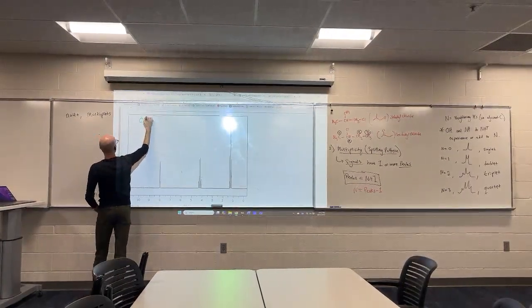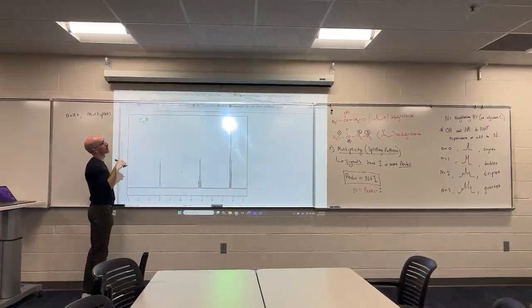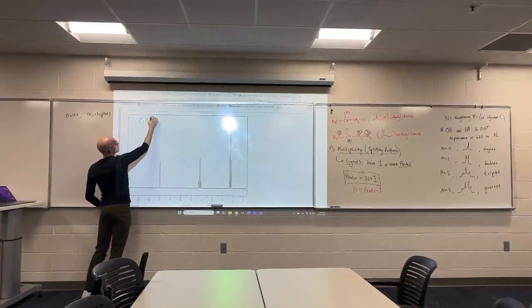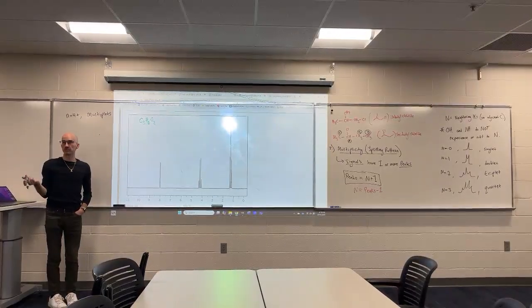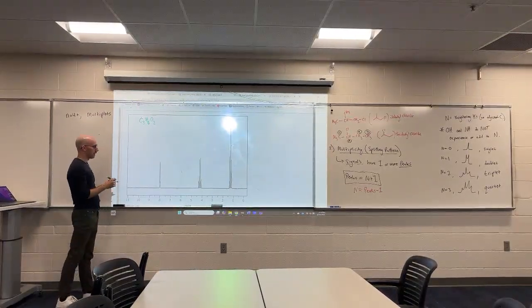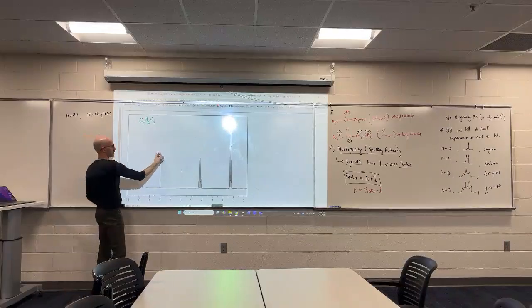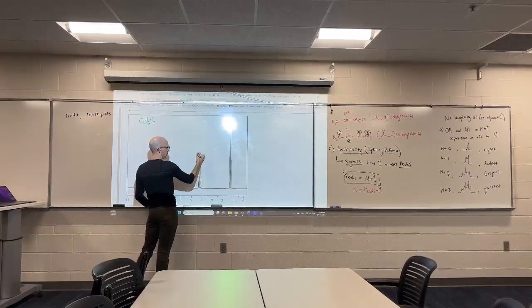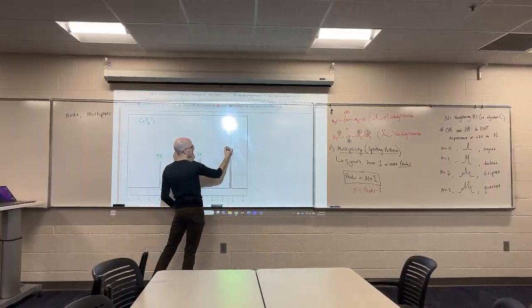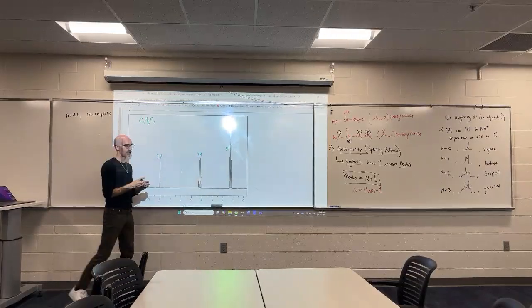This is the chemical formula. C3. Sorry, I didn't do the math first. H6O2. That's a small molecule. Yeah? And here are the integrations. 1H. 2H. 3H.